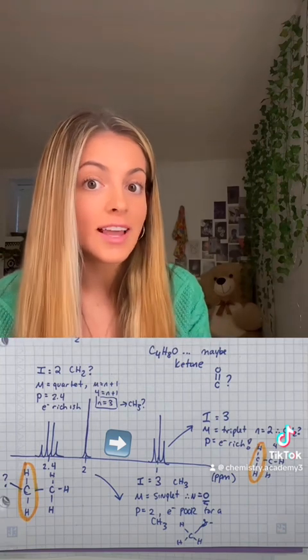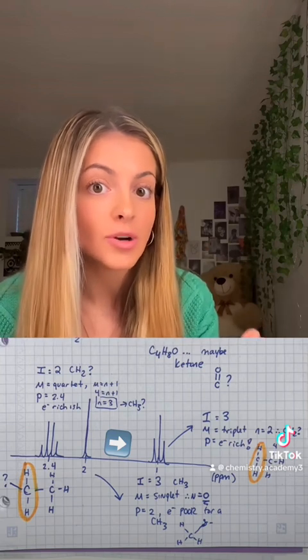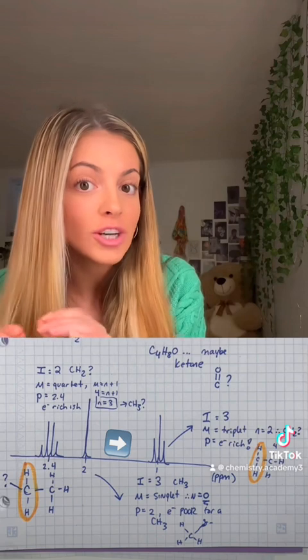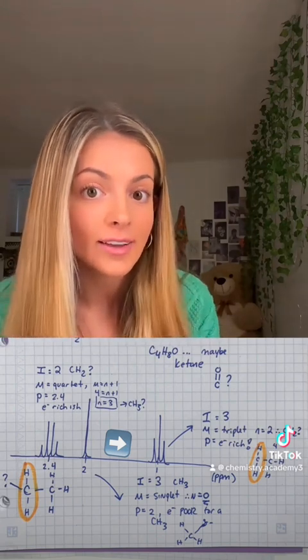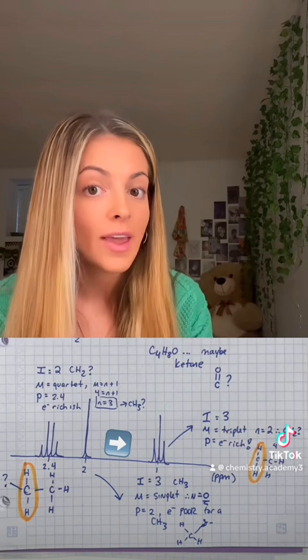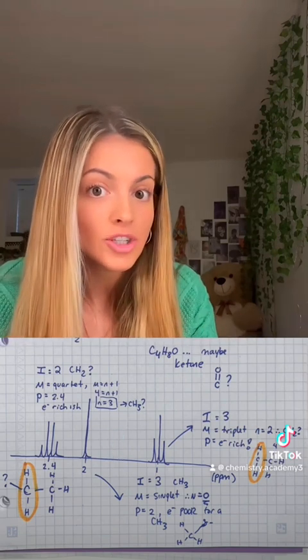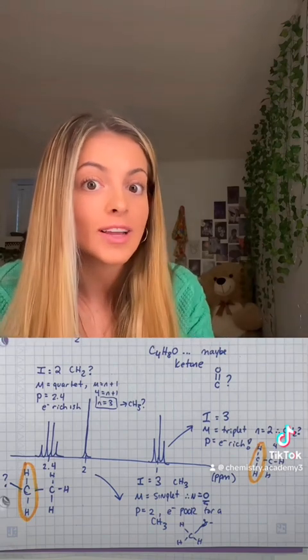So this would be a CH3 group, and its multiplicity of 3 tells us it has 2 neighbors. And this corresponds to the other peak we found previously that had an integration of 2 with 3 neighbors. This is good, we found the peak. So now we say, okay, there is for sure a CH2 connected to a CH3 in my spectrum. And the ppm is very electron rich. So this does tell me, yes, it's connected to a CH2, because a CH2 is not electron withdrawing. Hence the CH3 will be electron rich.